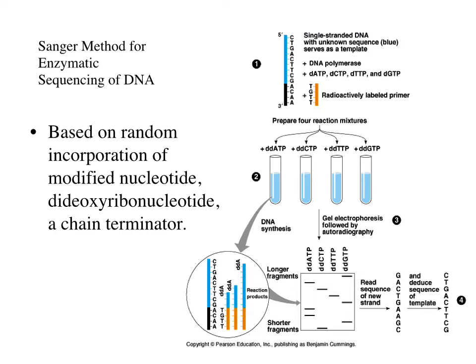Sanger sequencing is a method of DNA sequencing based on the selective incorporation of chain-terminating dideoxynucleotides by DNA polymerase. A chain terminator lacks a 3' OH for the attachment of the next nucleotide. The classical chain termination method requires a single-stranded DNA template, a DNA primer, a DNA polymerase, normal deoxynucleotide triphosphates, or dNTPs, and modified dideoxynucleotide triphosphates, or ddNTPs, the latter of which terminate the DNA strand elongation.